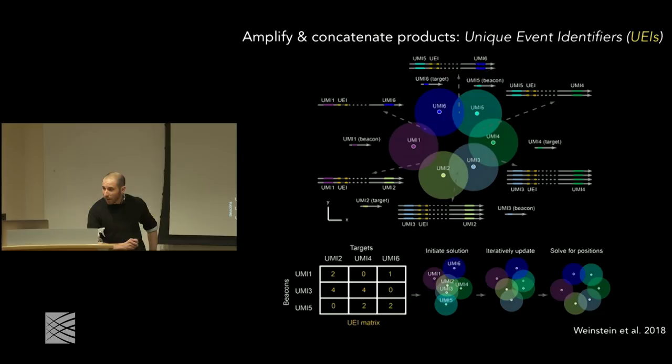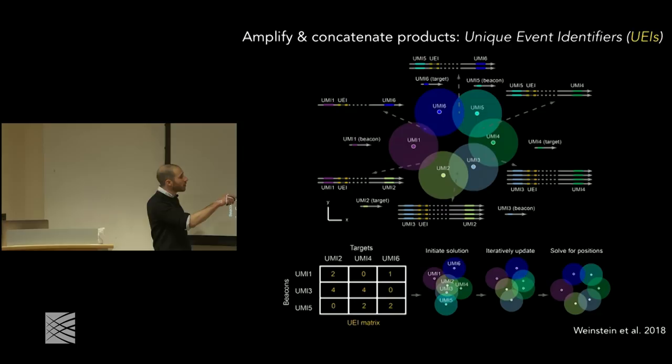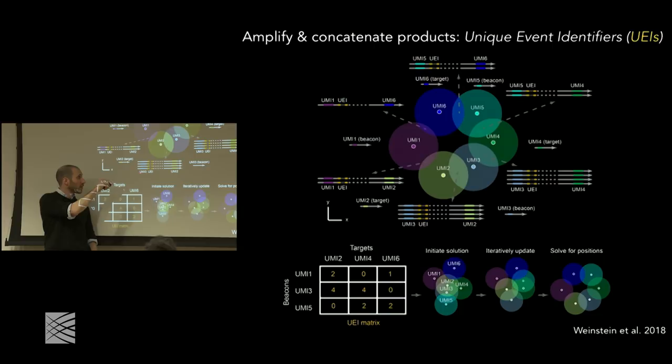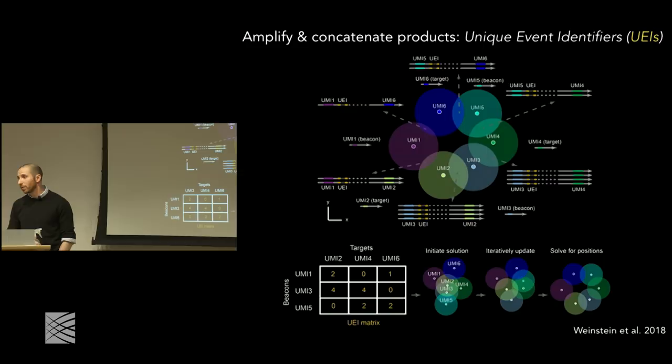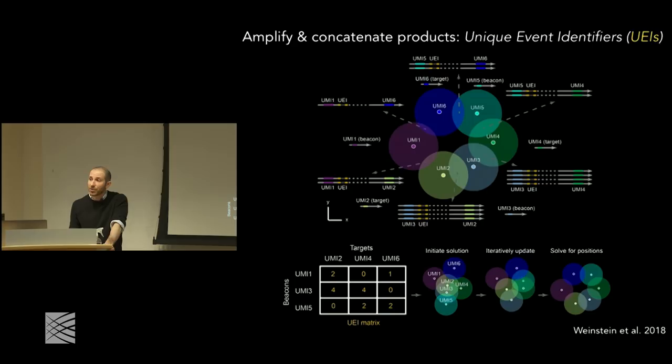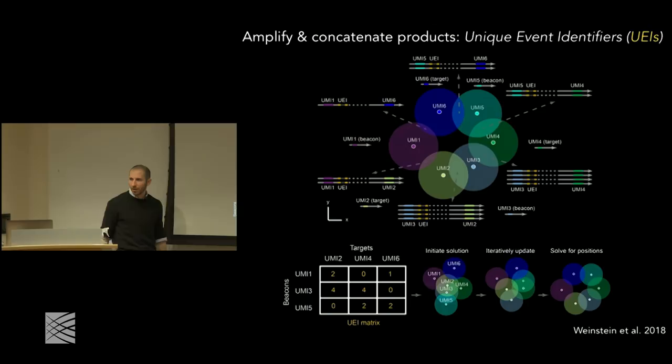It's primarily for practical purposes, mainly because of the read length that you're confined to on the two ends. What's nice here is that if you only need to read the endogenous, or gene sequence, of one of these sides, then you can get very high quality sequence information from both the beacon and the UEI, and meanwhile read from the other direction from the target UMI all the way through to what you're interested in biologically. So it's primarily from the standpoint of that technical advantage. However, there's also something to be said about the fact that you don't have to waste any sequencing on self reaction, as a minor aside. You don't have to worry about a particular molecule concatenating to itself so efficiently that you waste tons of sequencing data on just that. All right. Okay.